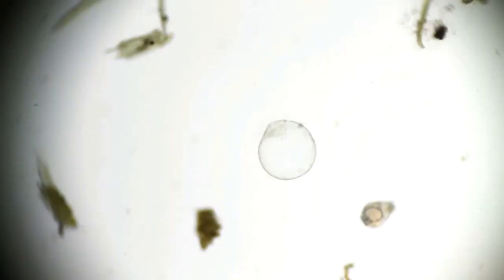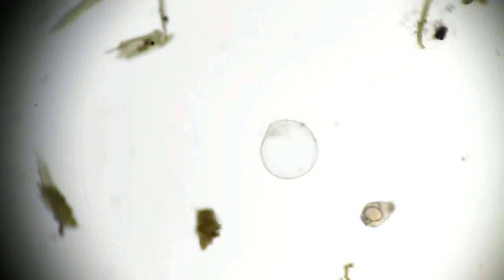I'm not sure what this is, but it looks like some kind of egg sac. I have seen rotifers hatching from eggs, and I've seen tardigrade eggs before, but this is a pretty empty sac of some kind. It's got some tiny little single-celled organisms zooming around inside it, but I don't know what that is. I'm no expert on microscopy, but just thought I'd film that because it looks really interesting.